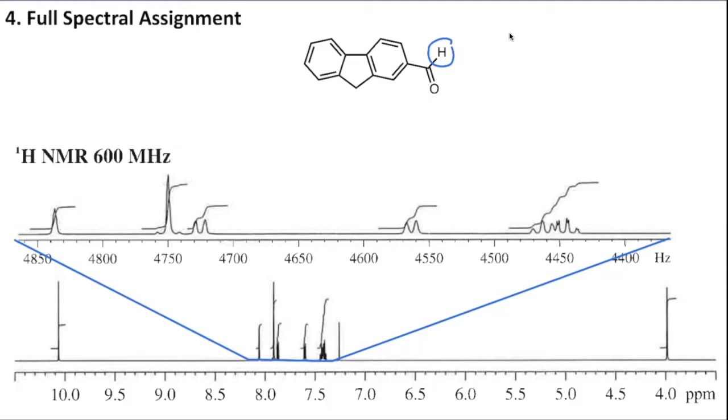Because that chemical shift is so distinct, I think we can go ahead and label that proton already. For these other ones, we may not have such a clear idea, so I'm not going to label many of them as we go along. We just want to say that this is our CHO proton. That's how we abbreviate aldehyde, CHO. And the other thing that we know about this is that since it's not blown up, there's nothing else for us to see here.